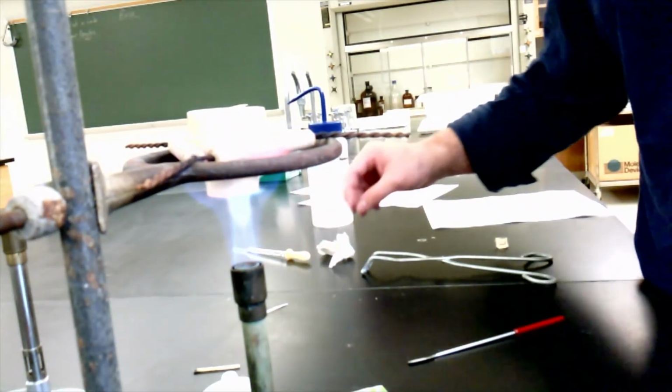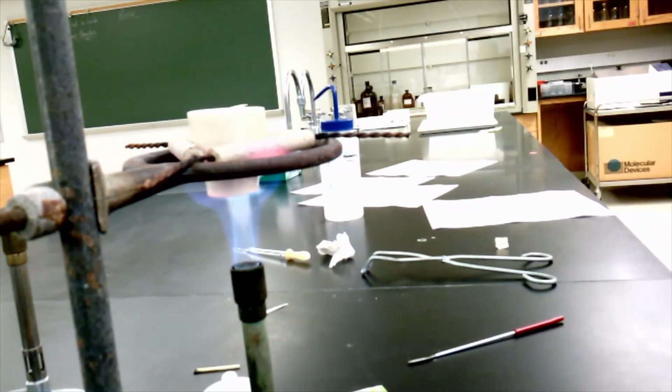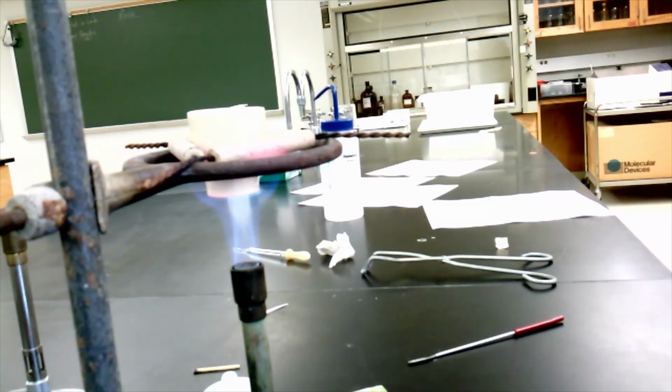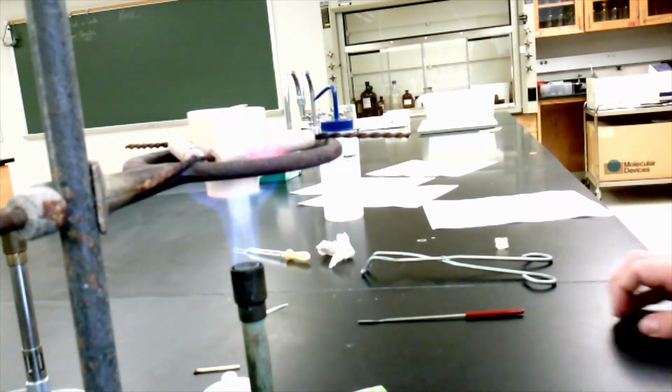Okay, now it's really important when I add the water. Well, first of all, why am I adding water? The water is going to react with magnesium nitride to give me two products: magnesium hydroxide and ammonia. So the whole point of this was to convert the magnesium nitride into magnesium oxide. It turns out once I get magnesium hydroxide, if I just heat that really strongly, it will drive off one more molecule of water, and that will give me my magnesium oxide product at the end.